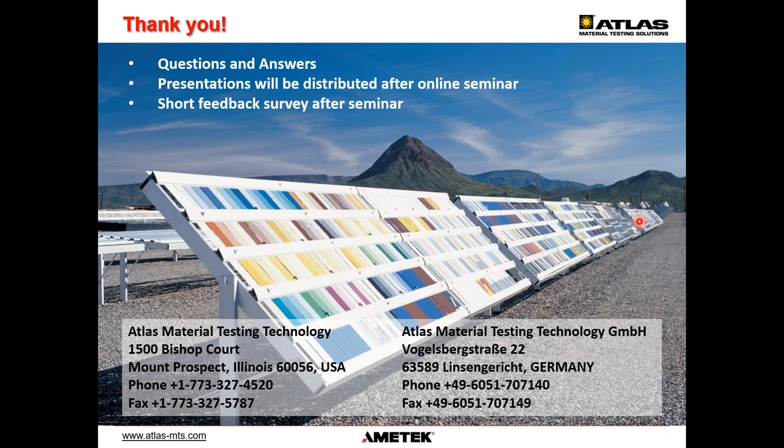Brings me to the question and answer session. We don't have a lot of time left today, but let's see if I can quickly answer at least a couple of your questions. I see it here: please do not say that a 10 degree increase doubles the rate. That is true in very few cases. And that's right. When you go through our fundamentals of weathering, part one, this will talk about how to really view that. 10 degrees C can mean even quadruple the degradation rates. It's just a rule of thumb. And maybe also attend the acceleration webinar and see how the temperature effect is discussed in detail over there. I can only really recommend to join that acceleration webinar.